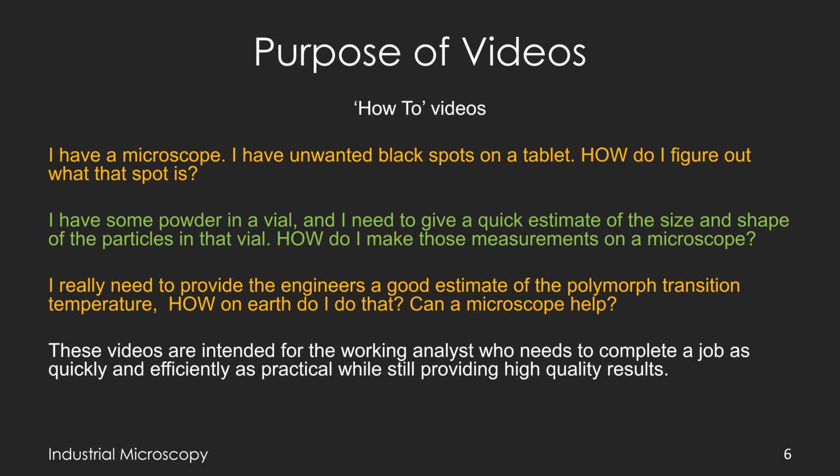So, why a set of videos? Well, I look at this as pretty much a capstone to my career. Now that it's sort of drawing to a close, I think the one thing I might be able to add is some how-to advice about where do you start when you want to determine what the black spots are on a tablet, or you have some powder that's been given to you, and you need to know something about the particle size and particle shape. How do you estimate something like the polymorph transition temperature, all using the microscope? So to sum it up, these videos are intended for the working analyst who needs to do a job and do it quickly and efficiently and still provide relatively high quality results.